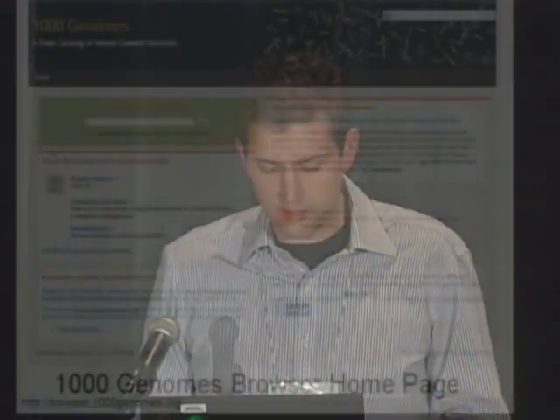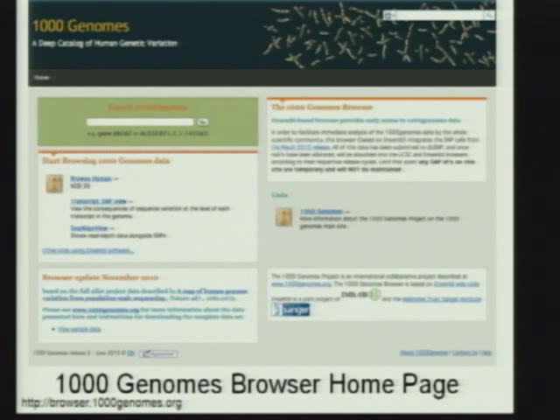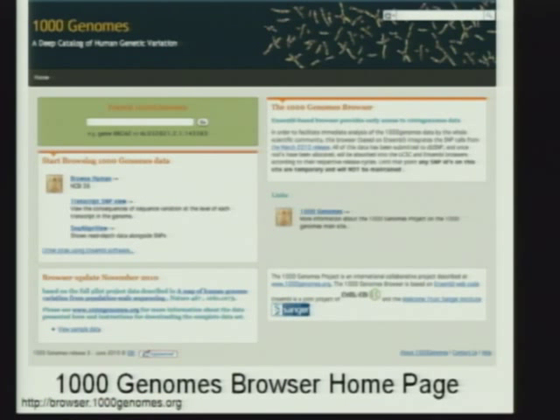Here's just a view of the homepage. One of the things that has been mentioned already, I just want to reiterate: all of the data that was reported in the paper last week was actually released as the March 2010 release of the data. So in fact the data has been completely available — all the SNP calls have been completely available for people to use for quite a number of months before the paper was released. This goes back to what Gil said about how the project is very committed to releasing data as soon as possible to make it as widely useful as possible for the community.